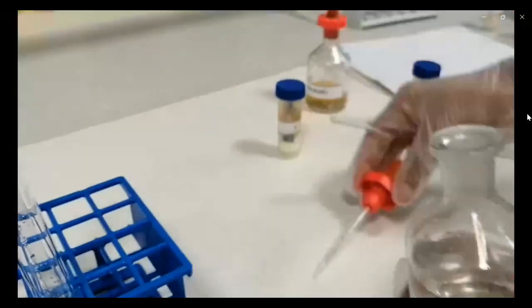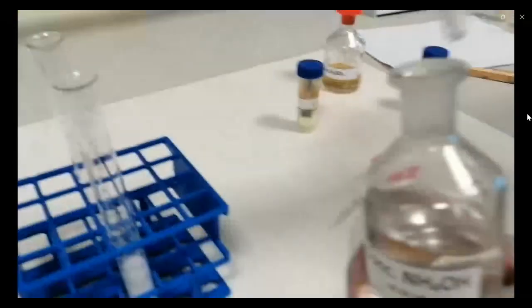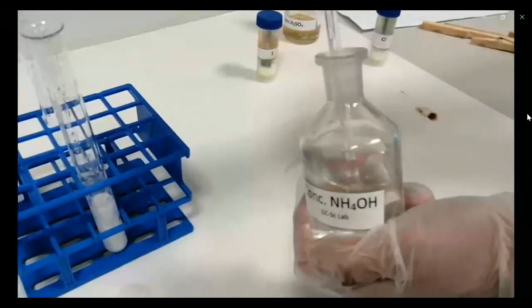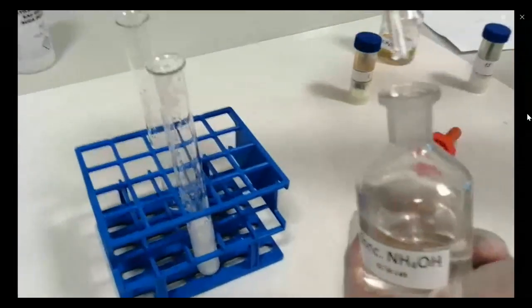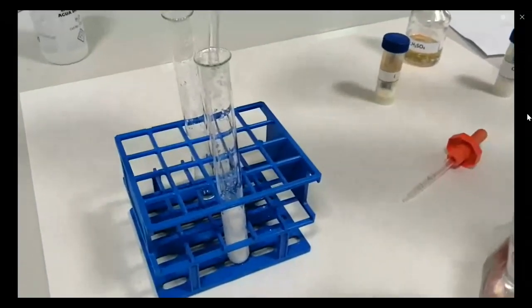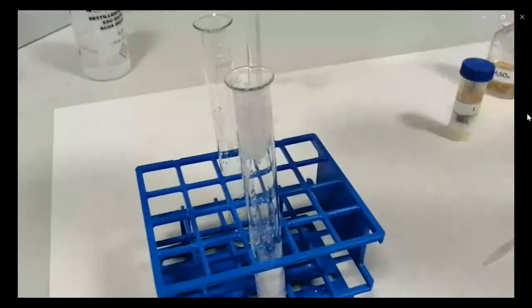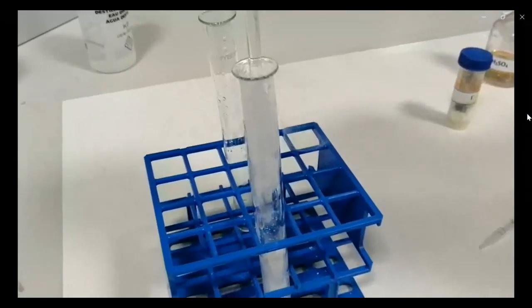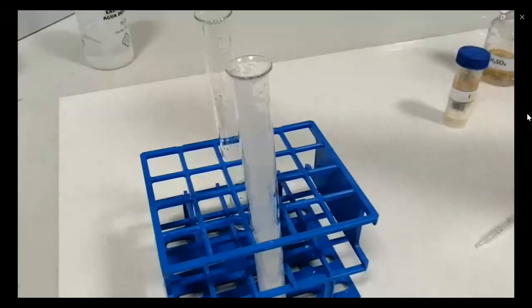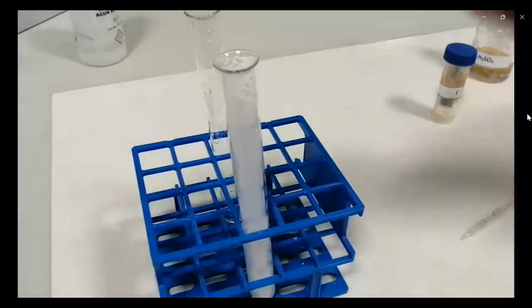Just use a glass rod moistened with ammonium hydroxide, and then expose it to the HCl gas. You will see white fumes formed. You can see that. Very clear. Very good.